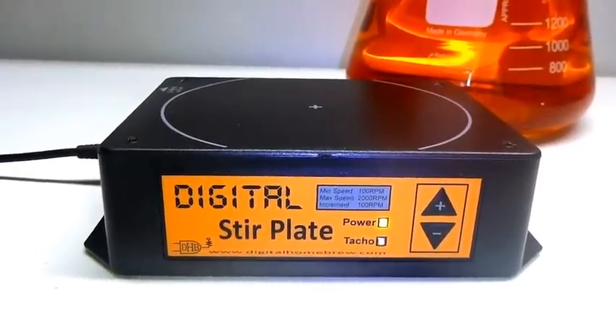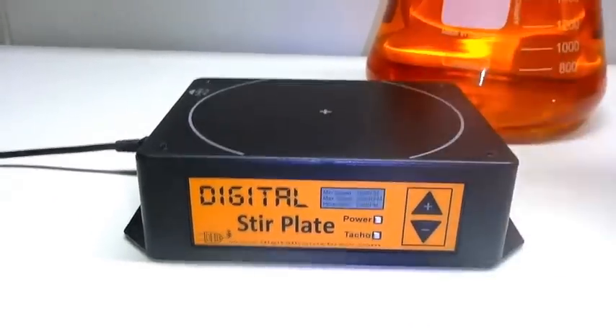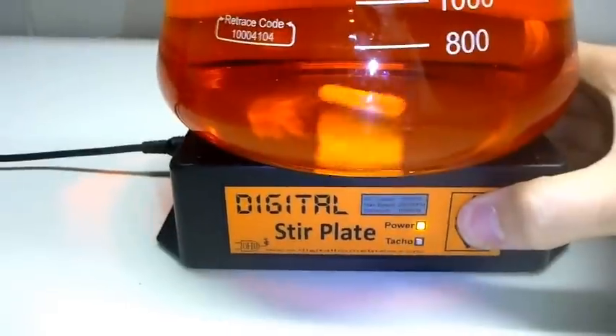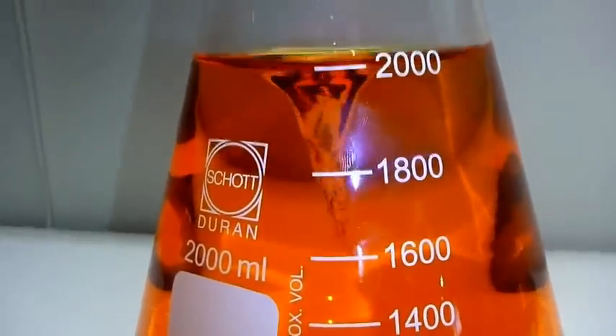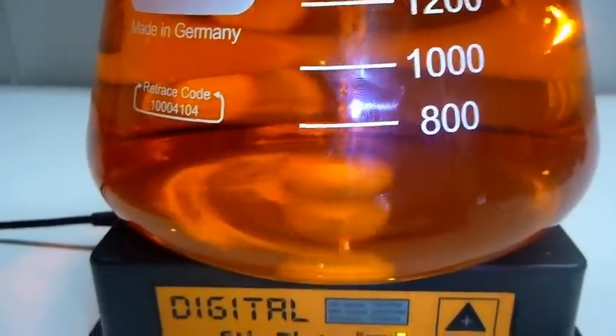I'll give you some demonstrations now with a 2-litre flask, 3-litre flask, and 5-litre flask. This is the 2-litre here — first thing you'll note is we can ramp that up straight away to full power and we haven't thrown the bar or anything, we don't have to worry about that anymore. We'll get a good vortex going here and it'll just start sucking in air.